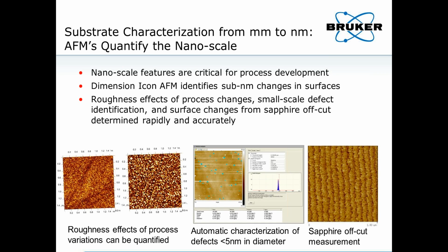Additionally, low-level defect characterization of less than 5 nanometers in diameter can be demonstrated and resolved using the AFM.